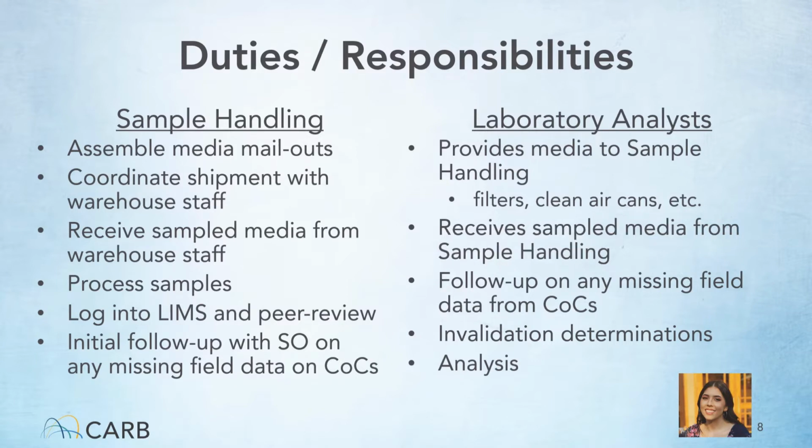to the laboratory analysts. At this point, any remaining questions about data entries from the field data reports are now handled by the analysts. Also, any invalidation decisions are determined by the analysts. Sample handling does not invalidate any samples.